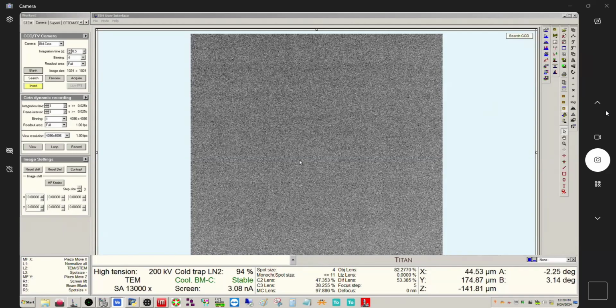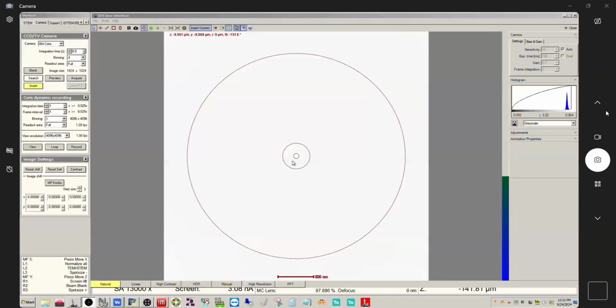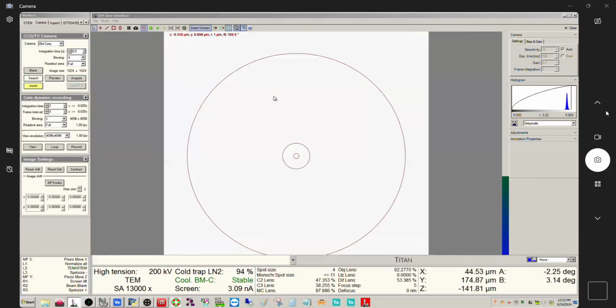Hello again, aficionados. I am doing a redo of the video about perfect zone axis diffraction patterns. The reason I'm doing this is because it was pointed out to me by one of my users, Garrett, who is a very observant gentleman, that I was not properly gauging the intensity in the patterns.